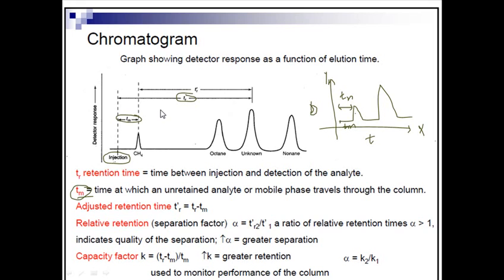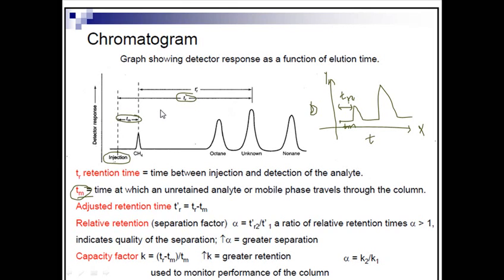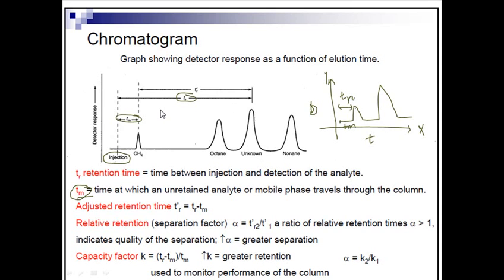The very first thing that arises here is the time TR, or the retention time. The mobile phase can travel really fast through the column, but after some time we have a peak. That means after some time a molecule from the molecular mixture can be eluted.